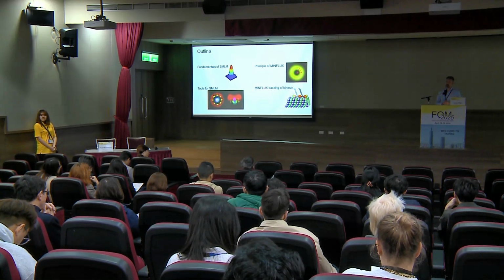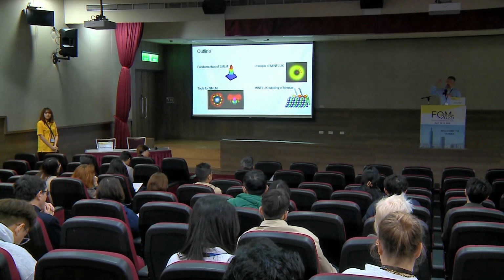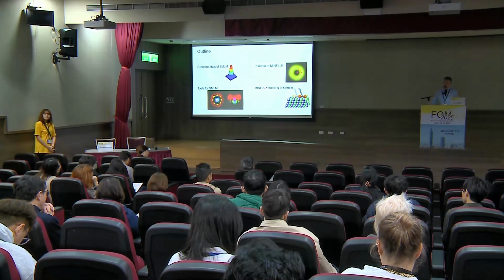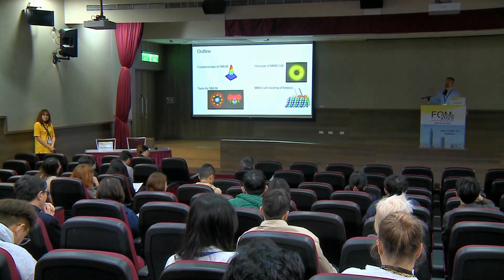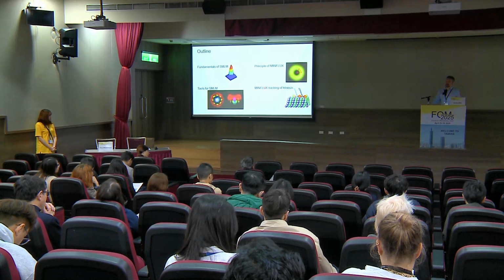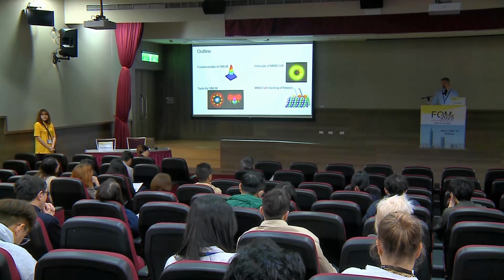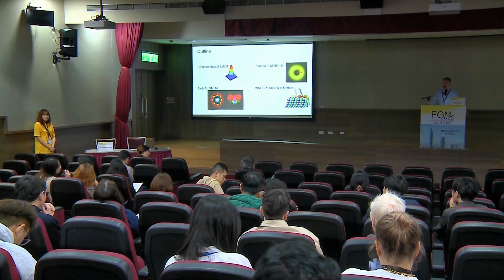You don't get them in biplane imaging, where you always have these symmetric point spread functions. And depending on where you are, sometimes one or the other is more in focus, so you might have a larger range with a good performance. But in the end, astigmatism is something like biplane, but the two planes are just in two different axes instead of two different halves of the chip. So it's very similar.